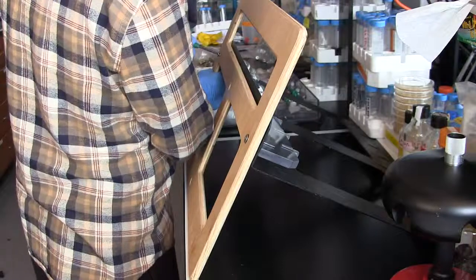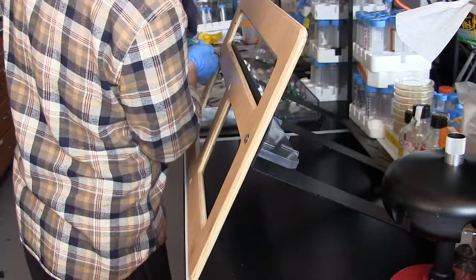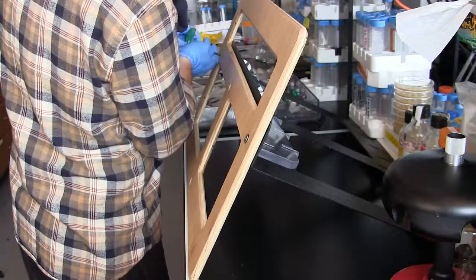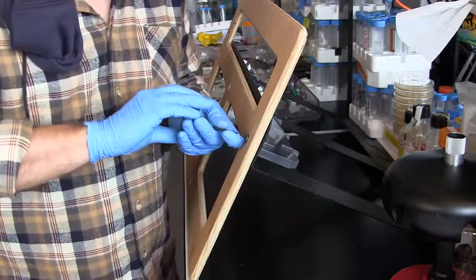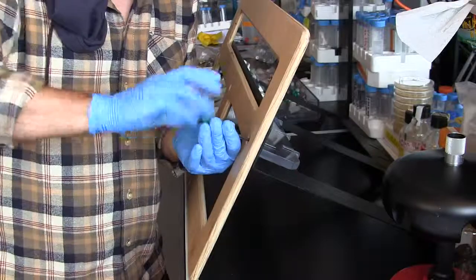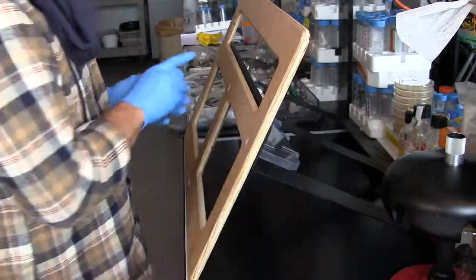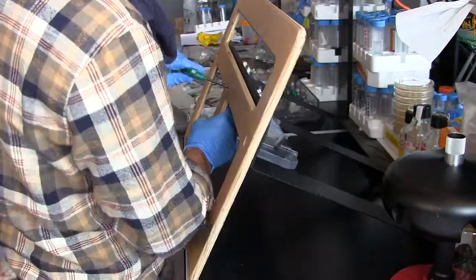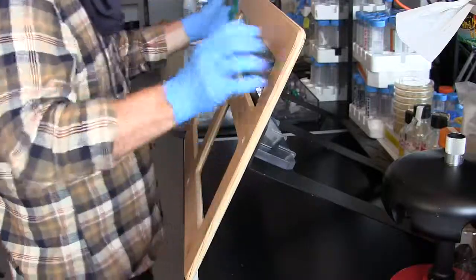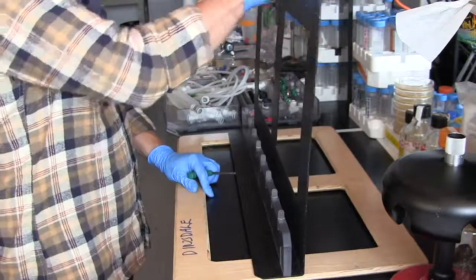Okay, first one. I don't tighten everything up all the way. Like the first bolt, don't do it as hard as you can until you get through all three. Just tighten them up a little bit snug for now, so you get all three lined up, and then just tighten them off a little bit. Tighten it off, tighten it off, tighten it off.